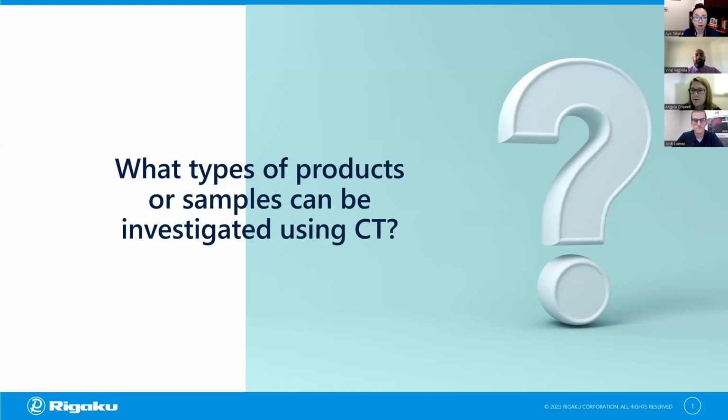All right. So I'll just say quickly, thanks again. And we're going to dive in and ask Josh a few questions about drug development, how X-ray CT goes in. So first question is the obvious. What types of samples or products can be investigated using CT, Josh?